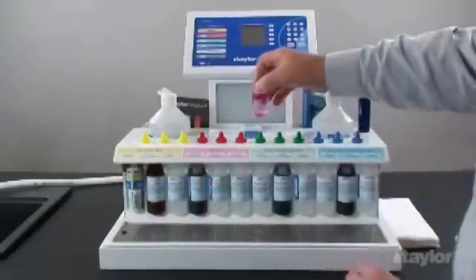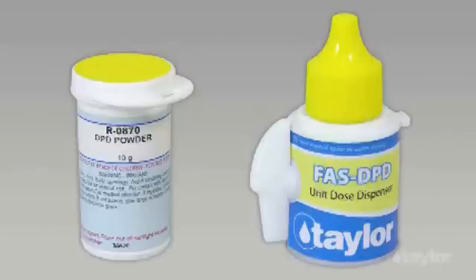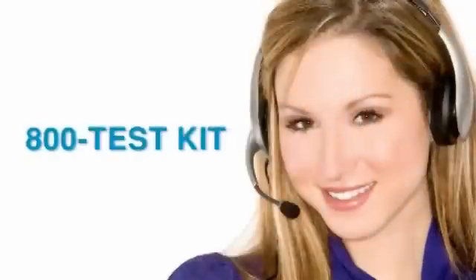At the end of the day, or if the indicator powder is not going to be used for a period of time, remove the dispenser from the powder vial and recap both the dispenser and the powder vial.